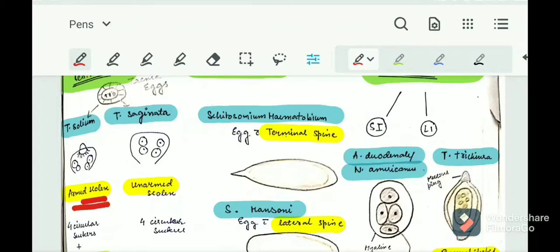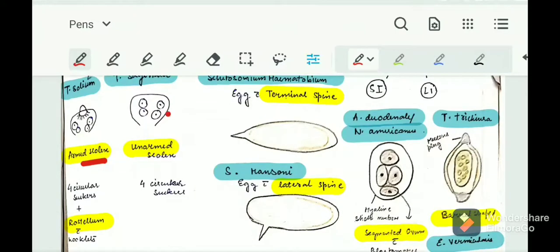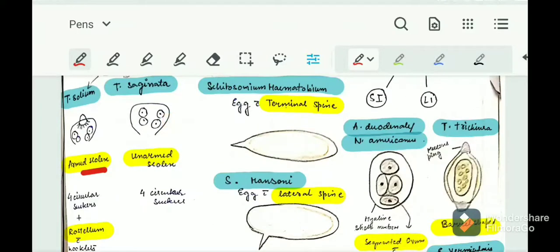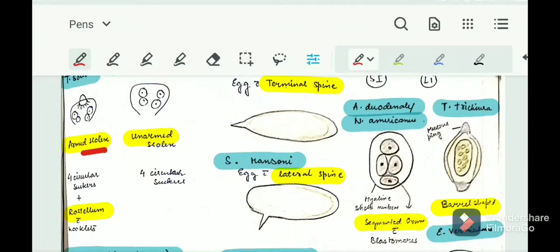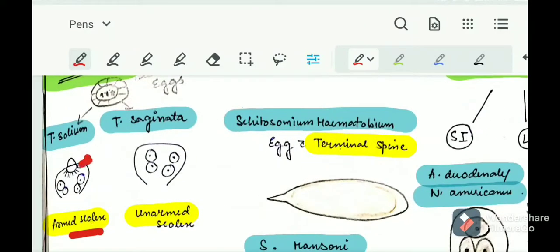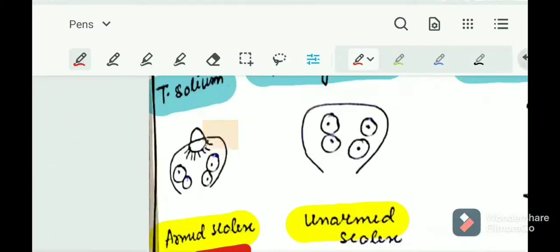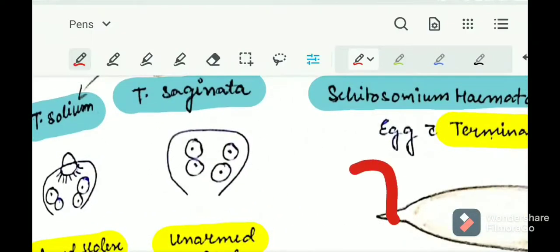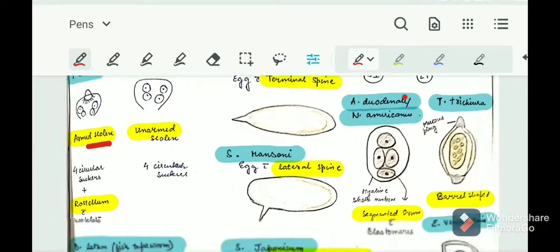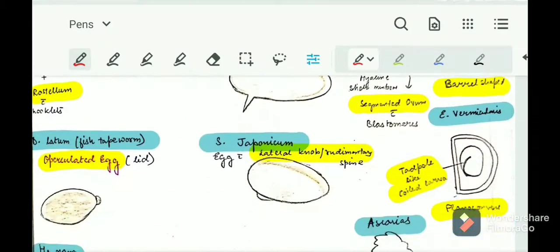Both Taenia solium and Taenia saginata share similar characteristics: both have four circular suckers. Another key difference is that Taenia solium will have a rostellum with hooklets. You can see the rostellum and the small hooklets on it. So Taenia solium has an armed scolex plus a rostellum with hooklets.